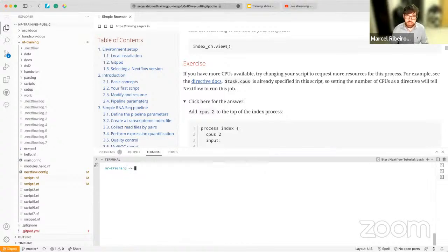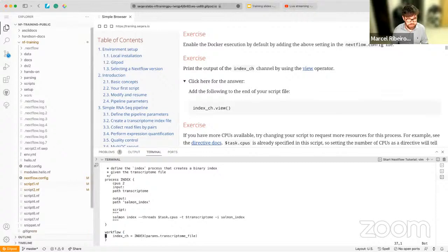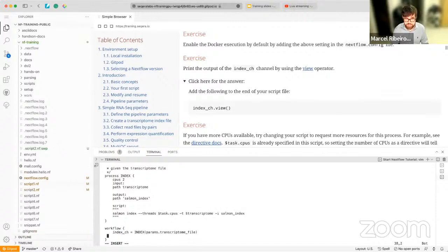Okay. Another thing you can do is actually to see the channel. That's something that Evan did a while ago, and we can do just the same. So at the end here, we are just writing to the path with all those files that you saw a few minutes ago. But not only that, I want to see what's inside this channel.